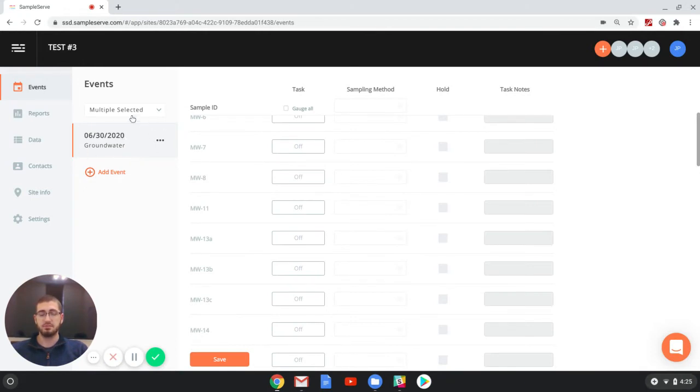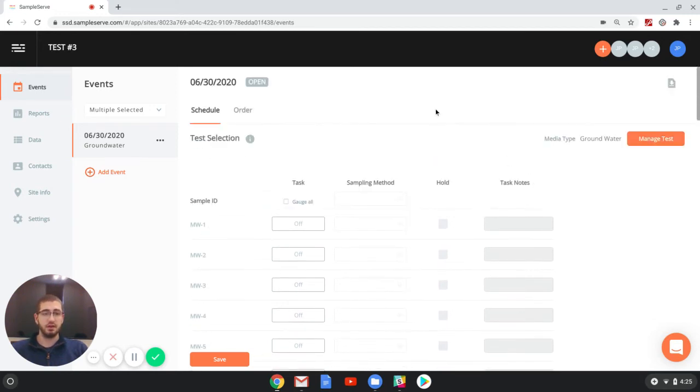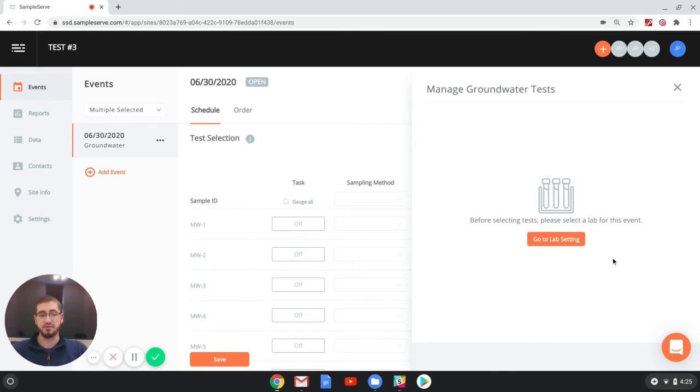So I have this project that's set up for June 30th, and if I want to go in to select a test for the sample event, it'll say that you need to select a lab before you do any management of tests.